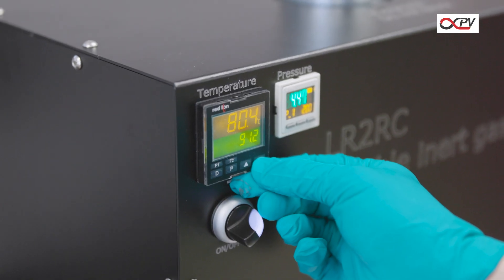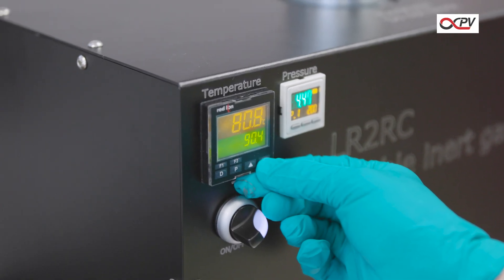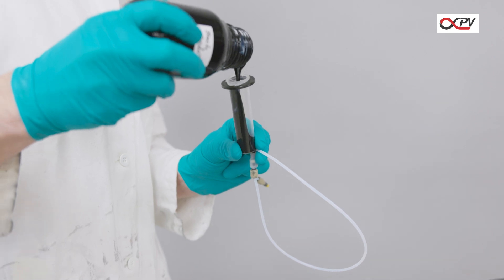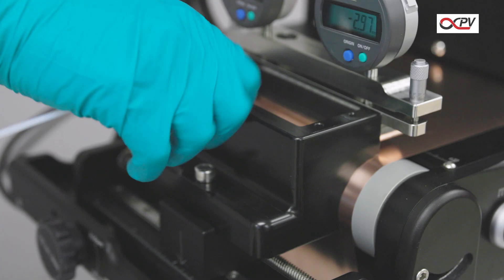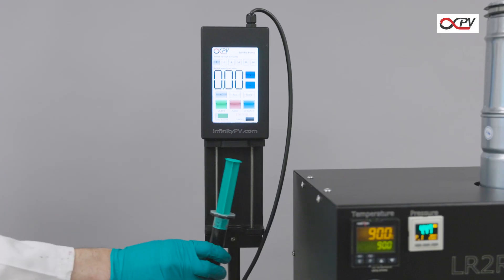Set the oven to your desired temperature, then prepare your ink or slurry by filling a syringe, connecting it to the slurry coater, and inserting it into the syringe pump.